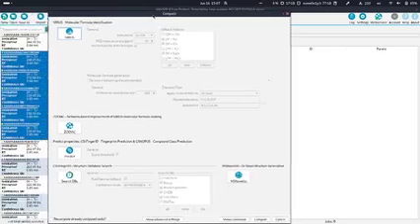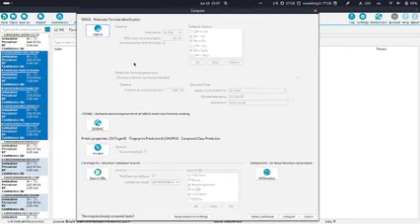And as I said, this looks a little bit different than what we just saw for one compound. For example, now we will see here this Zodiac button, which was not there when we just hit this on one compound, on one feature. Yeah, but just an overview. Kai already showed a slide that we now have pretty much two modes. We have the basic mode or the normal mode, which has most of the settings you might want to modify.